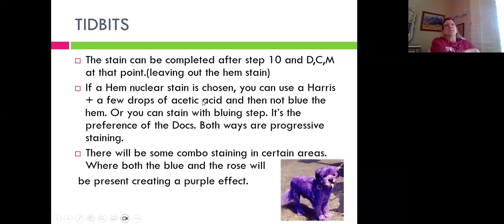All right, so this hematoxylin, you're going to see this throughout Carson. And she's going to say to put a couple drops of acetic acid in your hematoxylin.